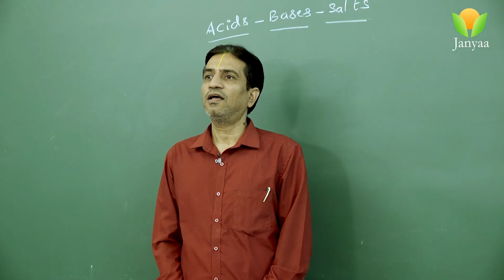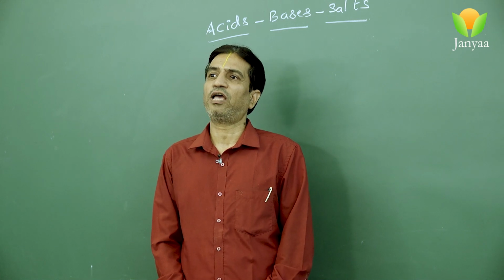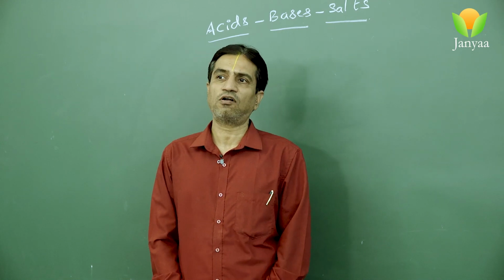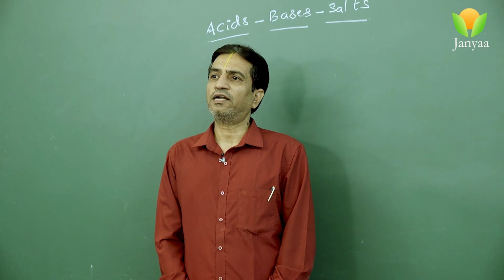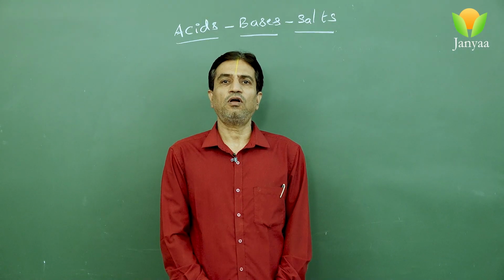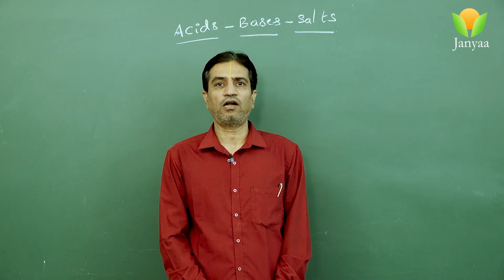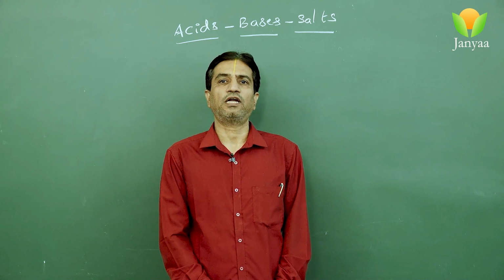By using our lesson on acids, bases and salts, in which we learn which materials are acids, which are bases, which are salts, and which are neutral. Already we know that we can test the soil by using the pH paper. Today in this video we discuss how to test the soil, what material is required to conduct the test, and how we can do that activity.